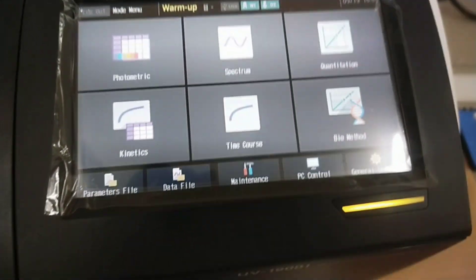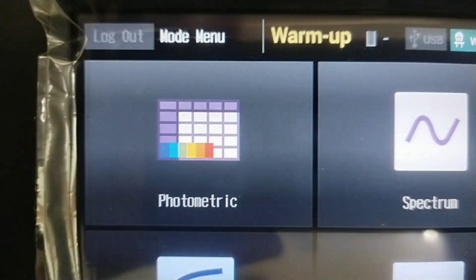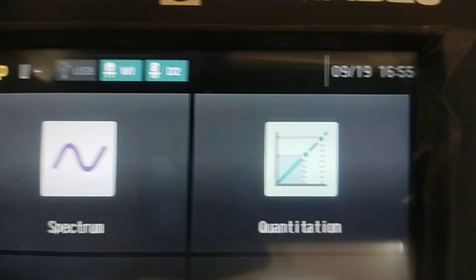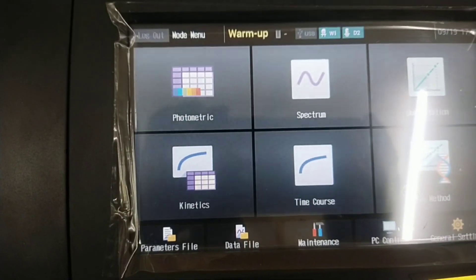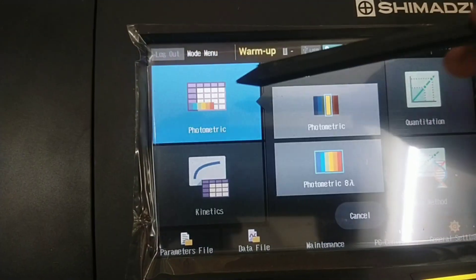On the mode menu screen, 6 types of measurement modes and 5 types of function menus are available. The measurement modes are: photometric mode, spectrum mode, quantitation mode, kinetics mode, time course mode, and bio method. The 5 function menus are: parameters file, data file, maintenance, PC control, and general settings.